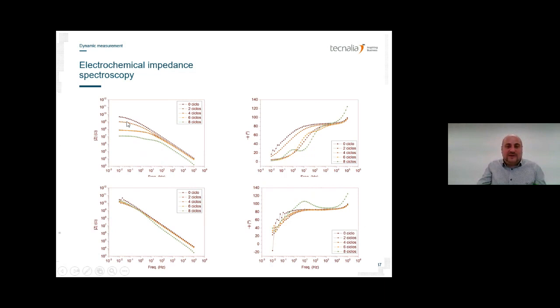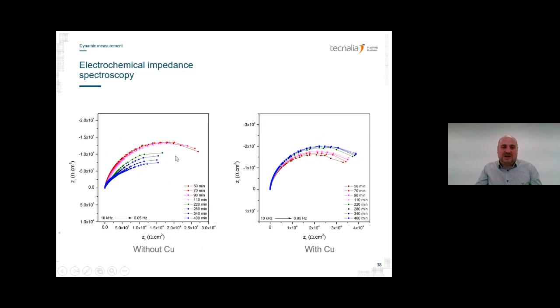So this is a very, very resistive system, which makes sense because it's actually a marine coating system with a primer layer and a top coat, and it's made to be very good and resist in very harsh environments. This one is actually close to 10 to the 12. So it is a very, very resistive material. This one is not that high, but not that low. And if we would see an impedance spectroscopy of zinc, for example, it could be very, very low. So that is the first thing that we can extract from the Bode plot.